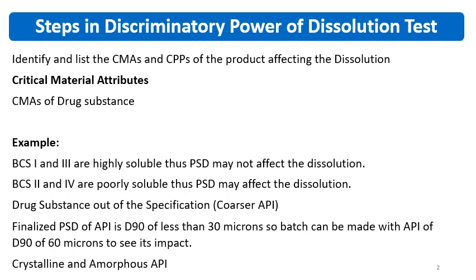In research and development, the scientists know the product, how their product is behaving, how the reference product is behaving in the dissolution, and the main factor for stopping the research work is having the similar dissolution of the test formulation with the reference formulation.